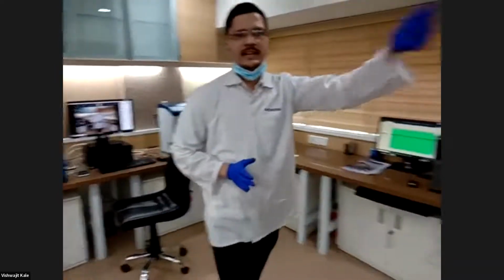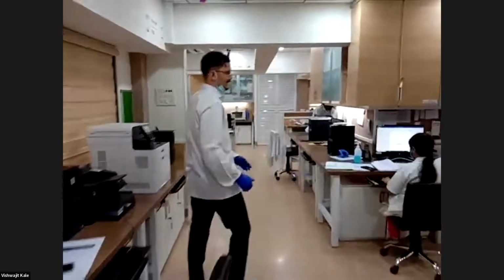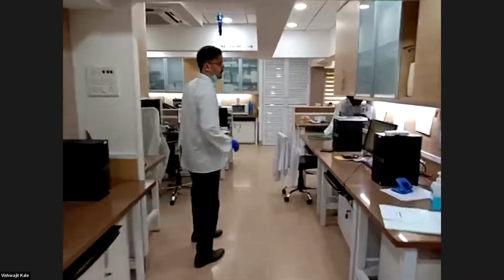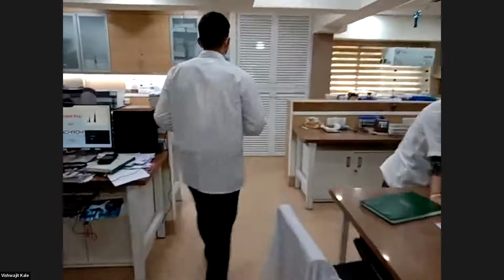There we have the wet laboratory area. We keep all the plates and stationary phases over there. So sir, please come with me. I will show you different plates and how we cut the plates and select the stationary phase.